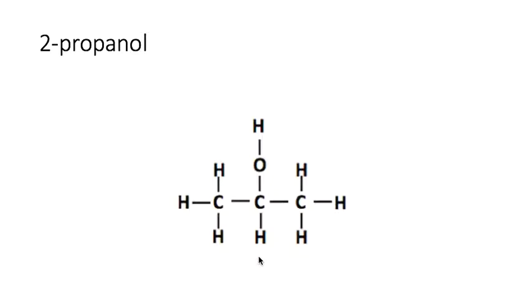Now, approximately half the molecules in your sample are going to have this spin up, and approximately half are going to have this one spin down. So the 2 peaks in the doublet are not exactly the same size, but relatively similar in size.